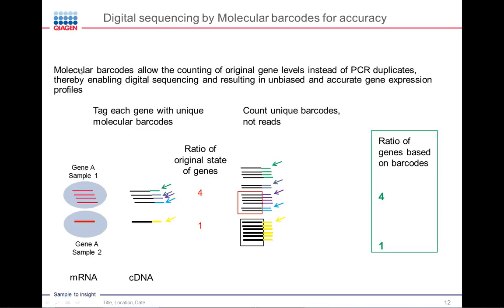But what we have done is to make the output of the secondary data analysis pipeline match the input that is required for the ingenuity pathway analysis. So it's basically an easy transition from that secondary pipeline into ingenuity pathway analysis.